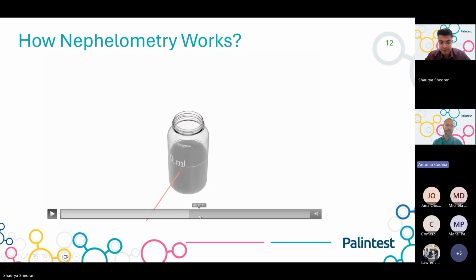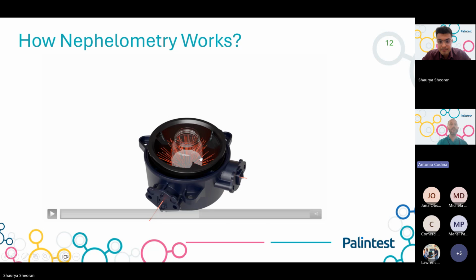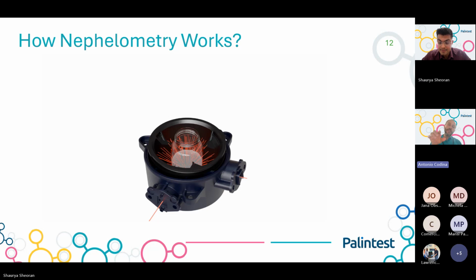It's probably not very clear in the image, but you see the grooves that you have there in the corners. Around the sample, there are some ribs. Those are making sure that all that light that is bouncing all over the place is not bouncing back into the sample and into the walls of the instrument and eventually getting to the detector. What it's doing is sort of catching it and stopping it there. That's why you have those little ribs in different positions around the sample.